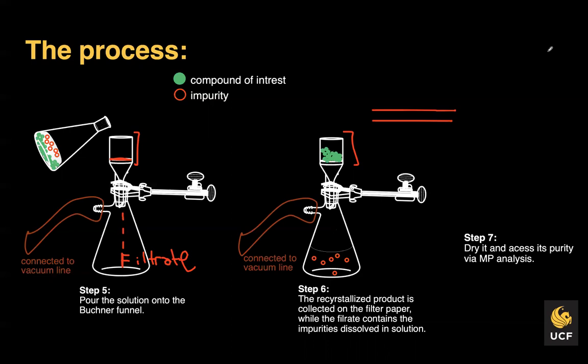Yes, so typically for the melting point, we have our little melting point capillary tube, and we have the solids, right? When we measure the melting point range, as soon as we see any part of the solid begin to melt, that's our initial temperature, whatever it is. Then we wait until we see everything completely melted, and that would be our second value.